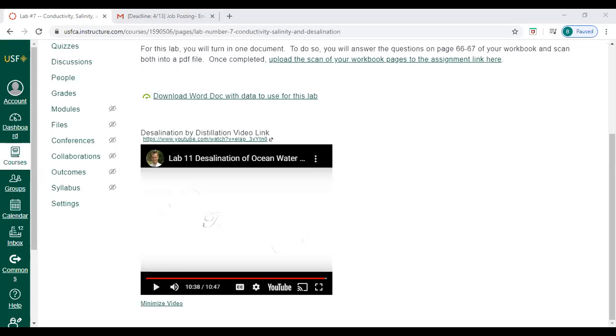That one did not calculate salinity, but the Hawk meter that we would have used would have taken the conductivity and done some complicated formulas, and it would have given us a salinity reading as well, along with temperature. So those are the three main parameters that we would have been using in this lab. And so that was part A.